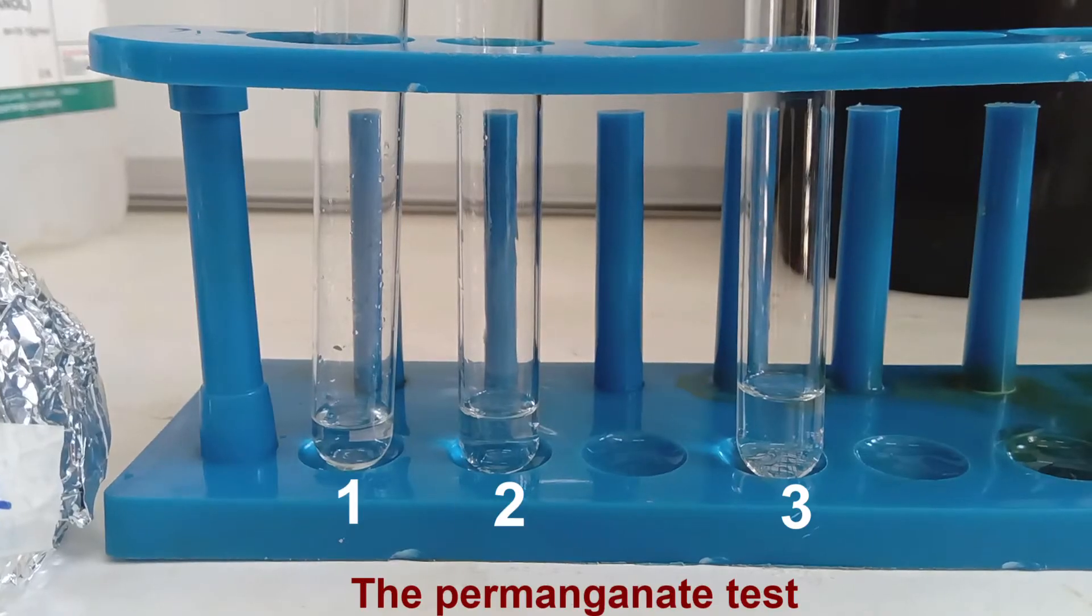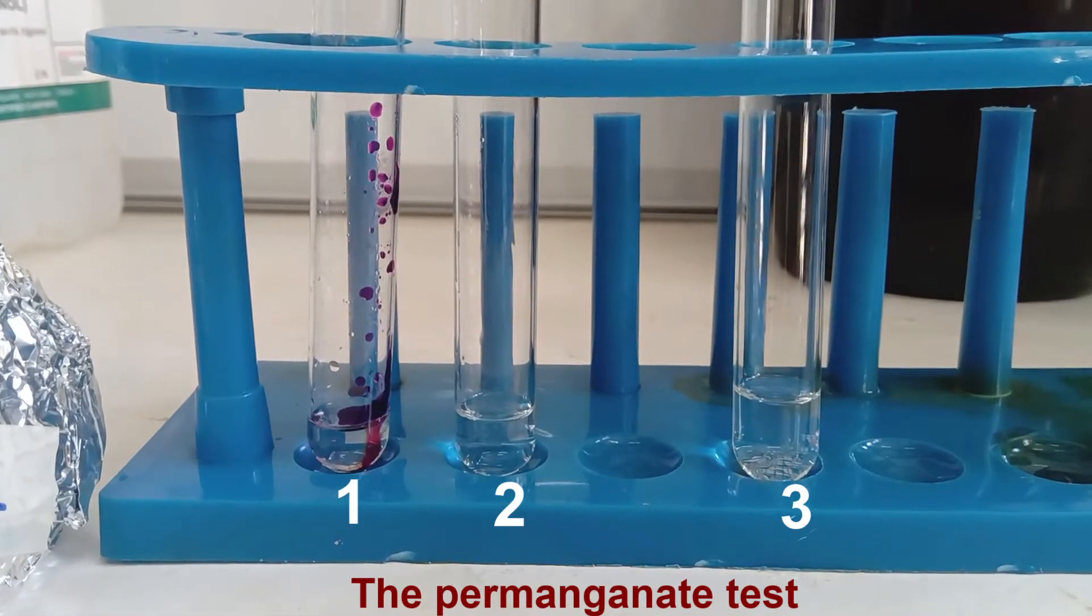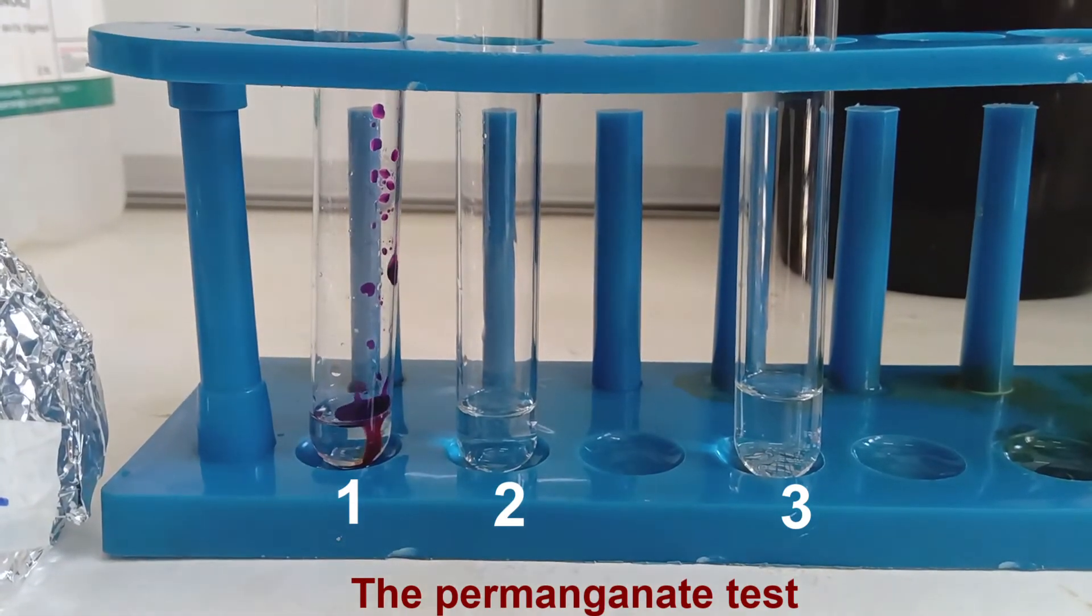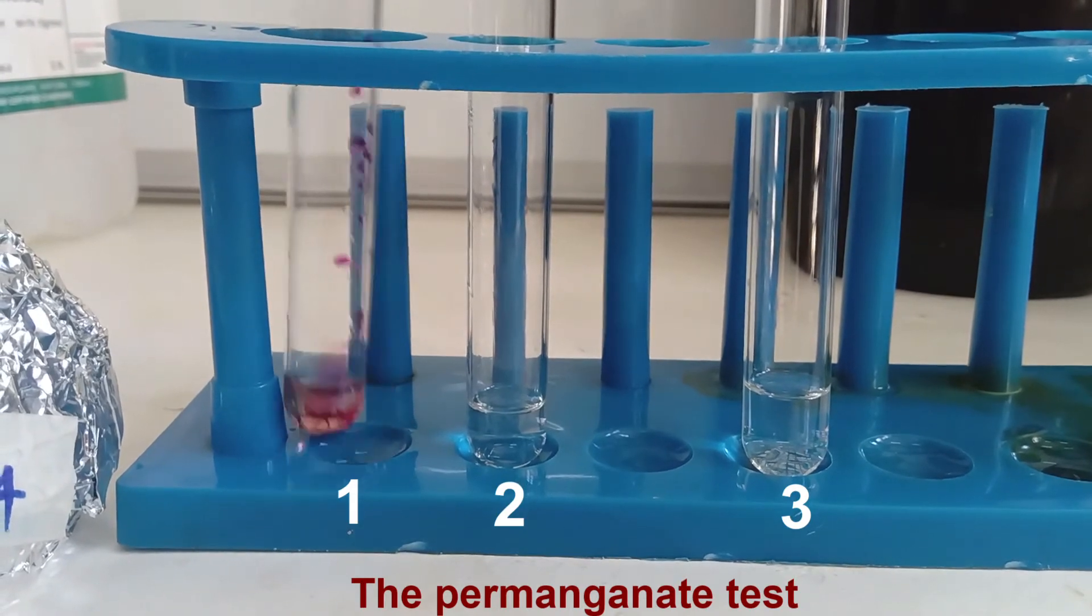In the potassium permanganate test, add one drop of the permanganate solution to a primary, secondary, and tertiary alcohol in test tubes 1, 2, and 3, respectively.